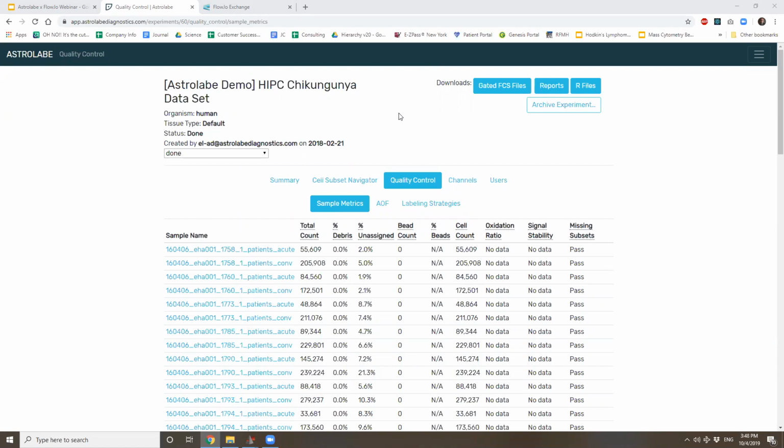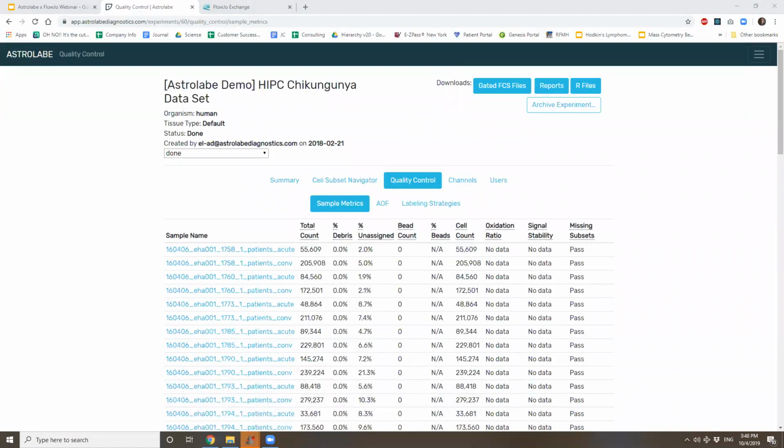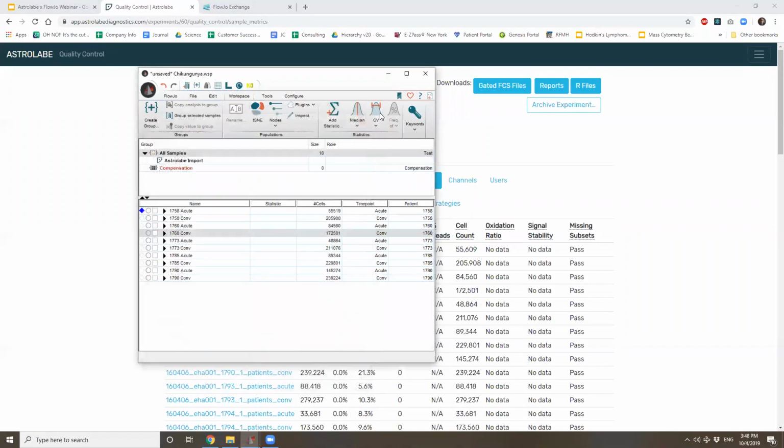Sure. A lot of the niftier FlowJo visualizations are actually built in through a series of plugins. And so biaxial plots can actually house more than 2 dimensions if we use something like tSNE. There are a few other options available as plugins. We can do UMAP.